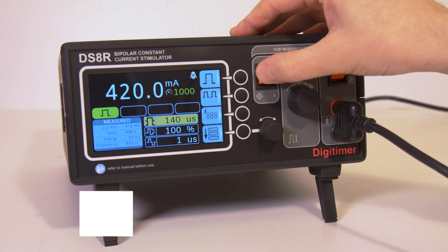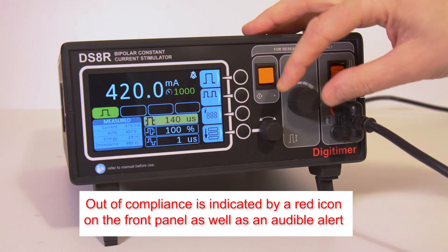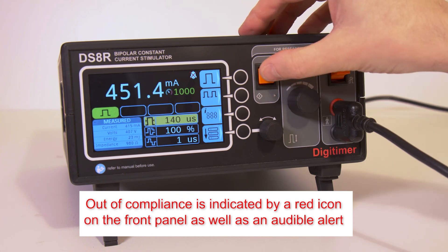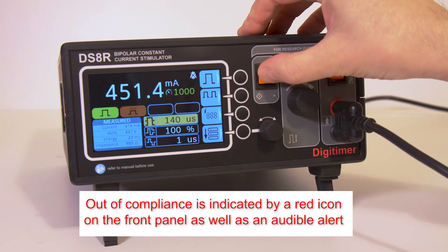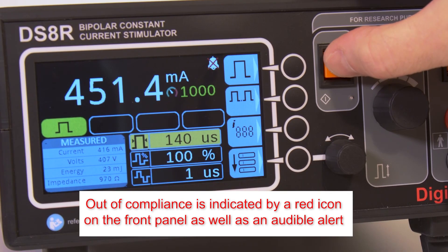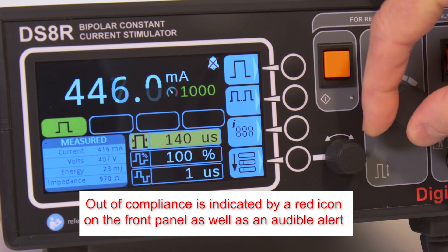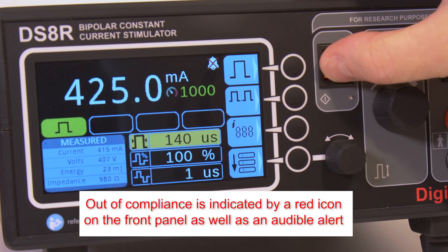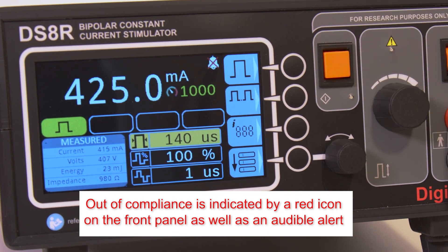As current is increased, the DS8R may reach its 400V compliance limit. If this happens, a red out-of-compliance warning icon and an audible alert are provided to make the operator aware that the requested current was not delivered. The operator can choose to reduce the current until the warning stops, or attempt to lower the electrode impedance by using larger surface area electrodes or more rigorous skin preparation.